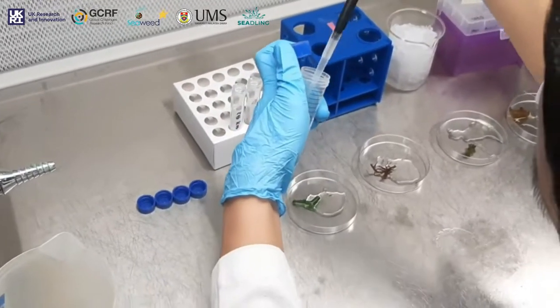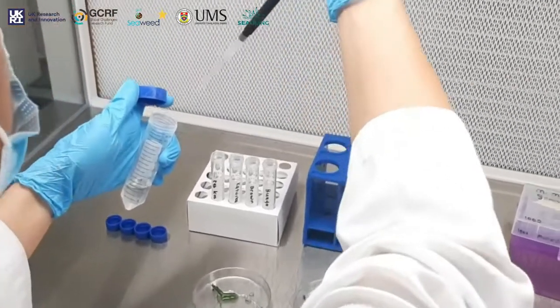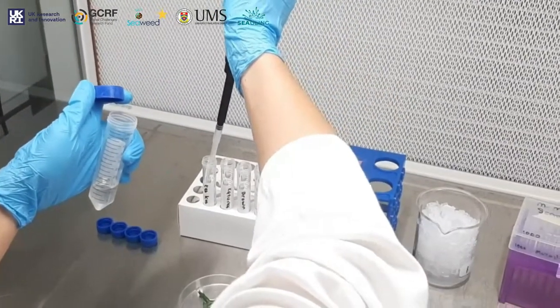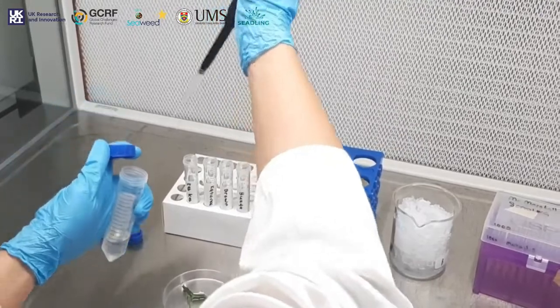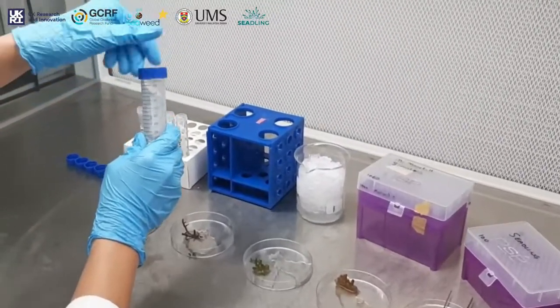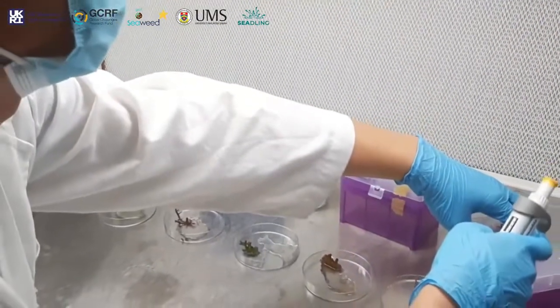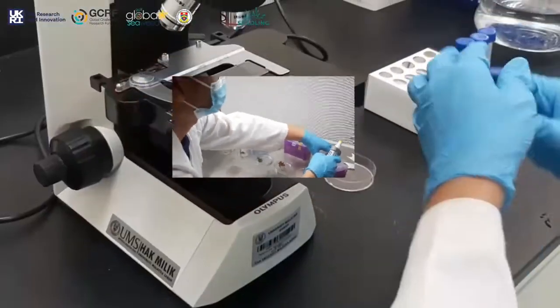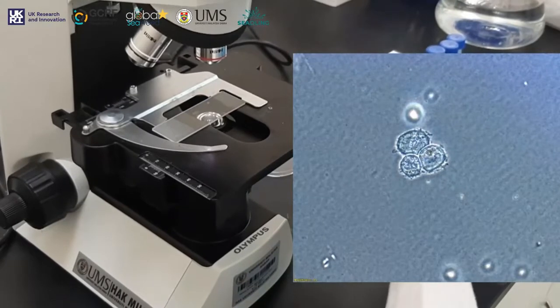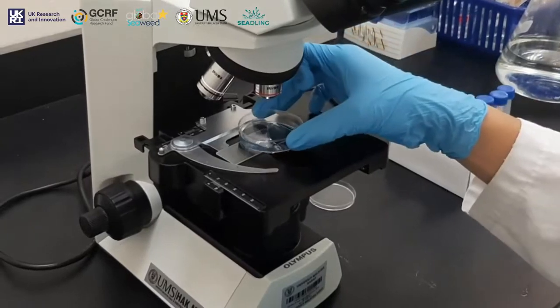Once a protoplast is isolated and established in a culture medium, it can then be transformed into a fully grown plant. Protoplasts can also be hybridized to create new variants and new species. The process of protoplast cultivation is unique to each species and the protocols must be established for each species. Following the isolation of protoplasts, their presence can be verified using microscopy and stains that only stain fully viable protoplasts.